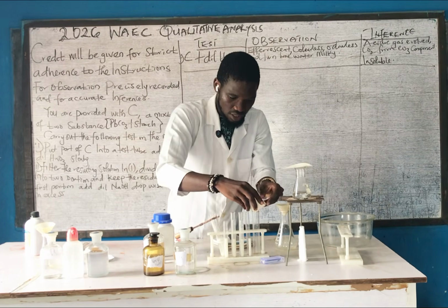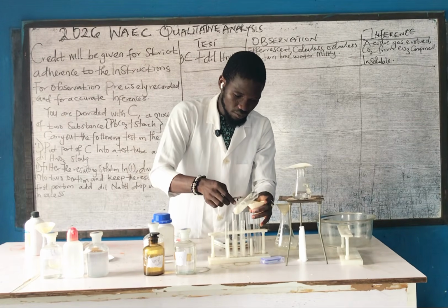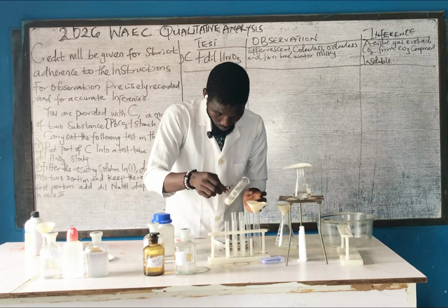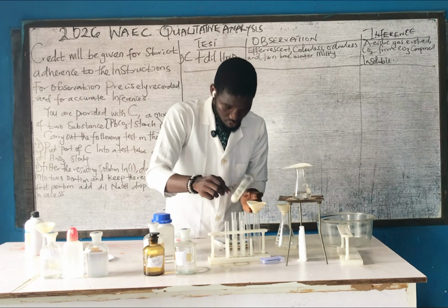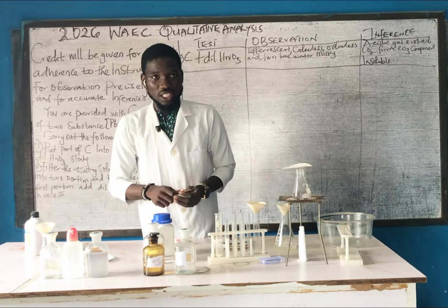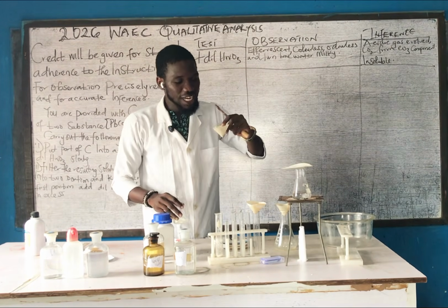So if I have this, then I'll pour it there. As we are waiting for it, I have a prepared one that has separated the residue.